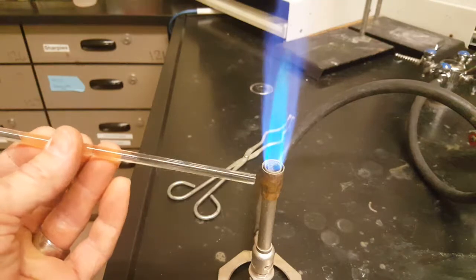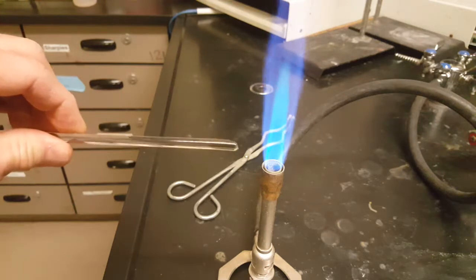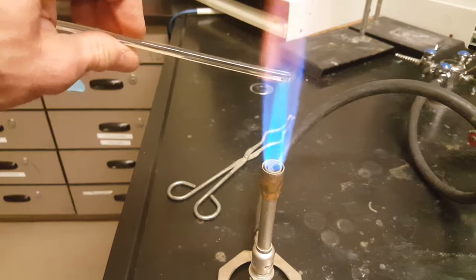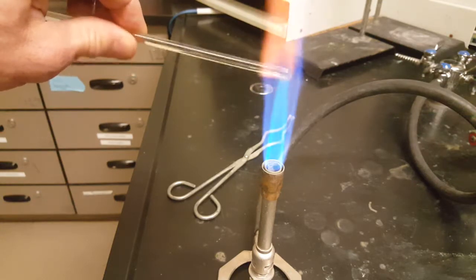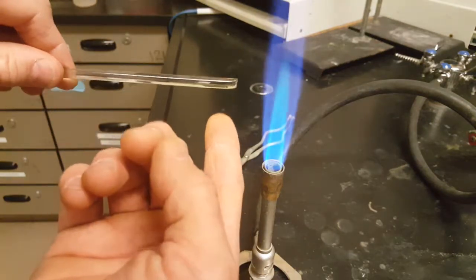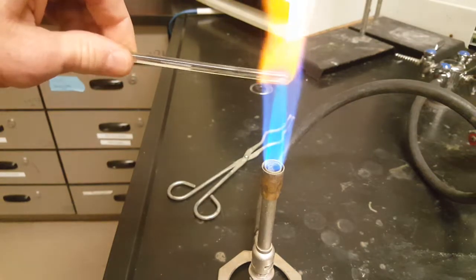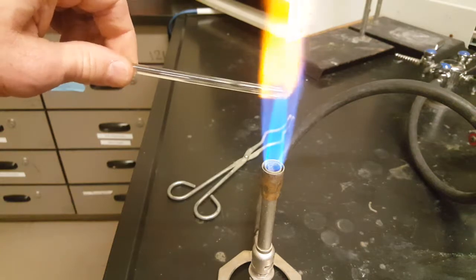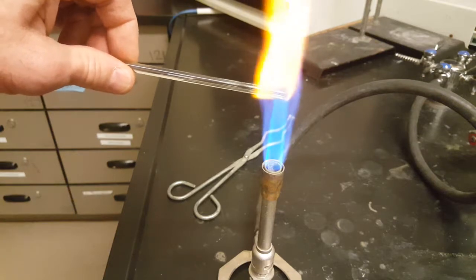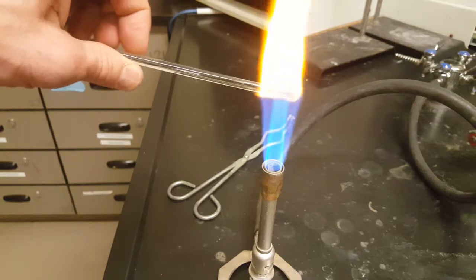Glass is an exceptional insulator, so you shouldn't have to worry about the heat traveling up the glass stirring rod while you're turning it in the Bunsen flame. But you will want to be very careful about touching where the Bunsen flame has been burning, because that'll be 1100 Celsius and it'll burn you. If you want to wear gloves, we've got a few sets of heat-resistant gloves you can borrow. Otherwise, if you're worried about burning your hands, maybe this isn't the task for you.